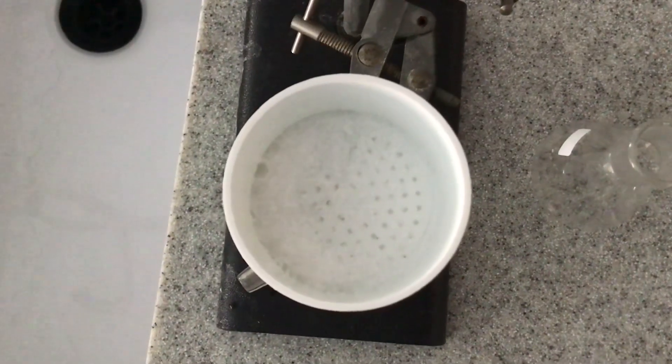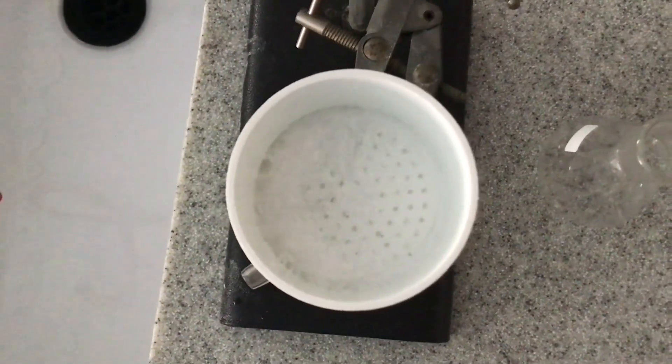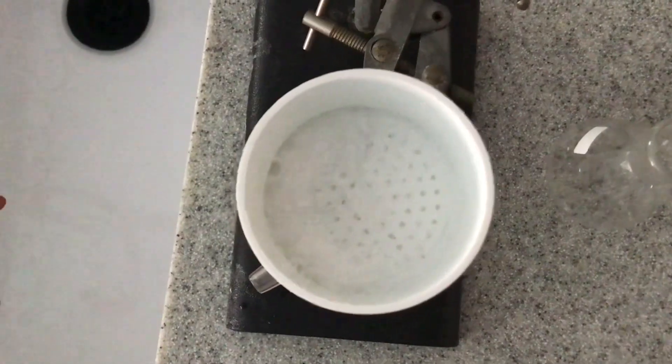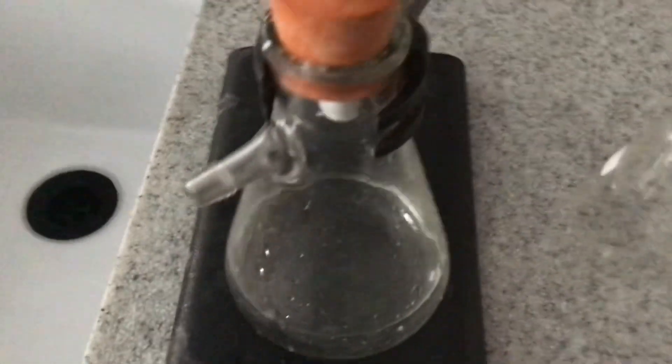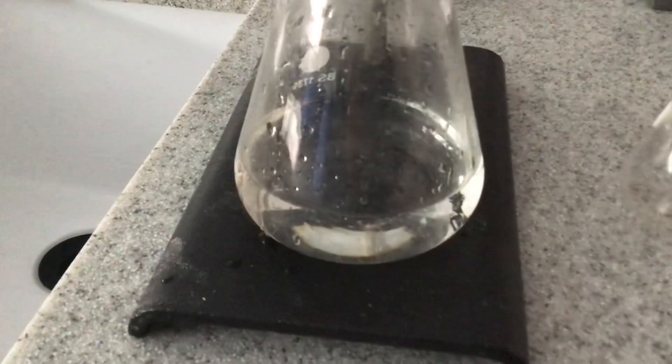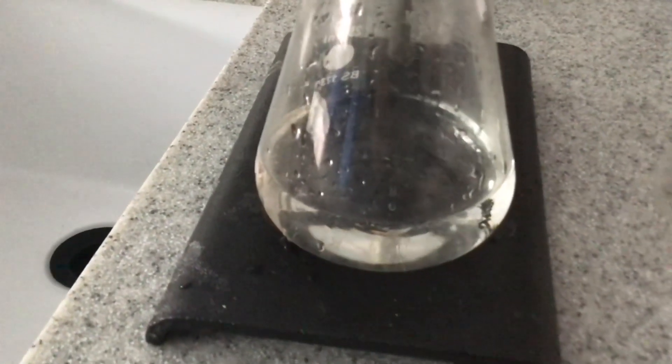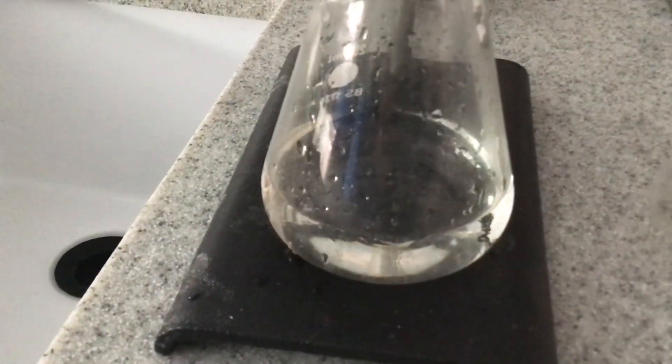Hopefully you can see there we've got crystals on top of that filter paper and the solvent is in the flask. The separation has been done. That's vacuum filtration, a really useful process if you're wanting to recover a solid product.